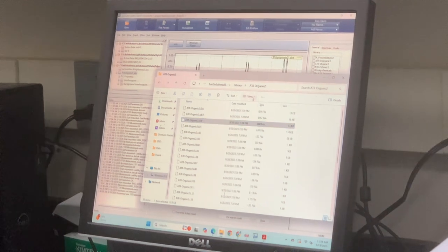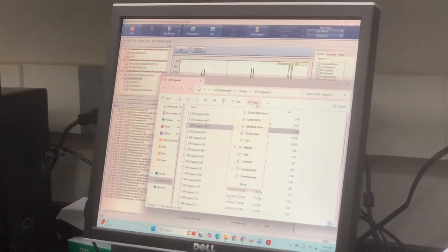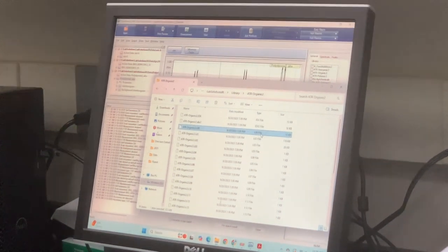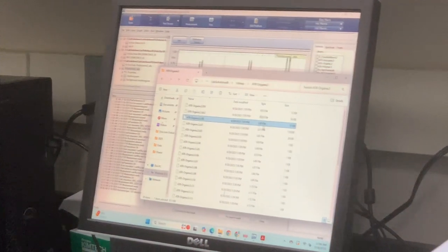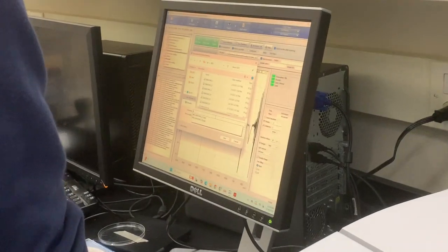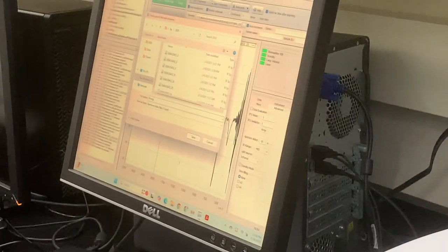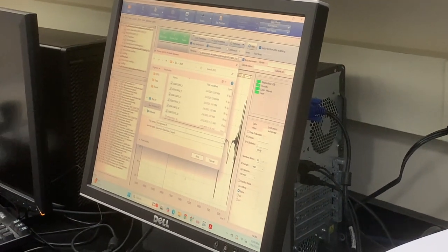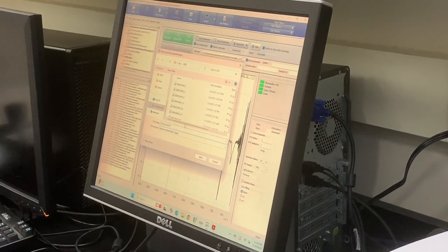Sometimes you need to view file extensions. That's it. Okay, the LOOIDX files. And this is going to be the name of the file that's run? Background. So that's going to be the file name. The background scan is always going to be last background. Exactly.